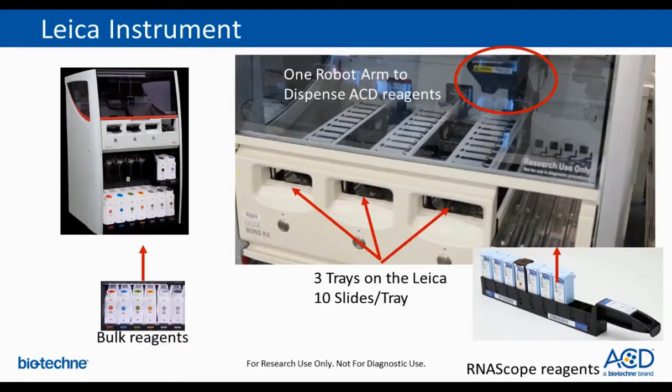It's the Leica BOND. You have bulk reagents at the bottom. Just be sure there is enough reagent to run the number of slides that you want to run. If you don't have enough, the software will complain and tell you.